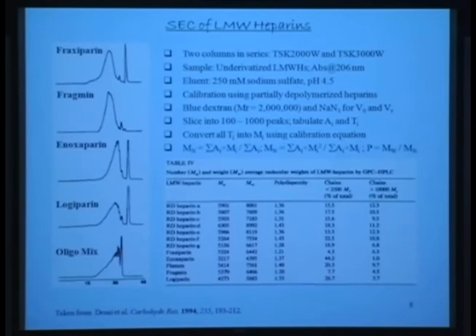Okay. Do you know what is number? Yeah, go ahead. What standard do you use to find these? Standard? Yeah, in order to find the actual molecular weights. What standards were used? Okay. In this particular case, we used predefined standards, calibration with partially depolymerized heparins.